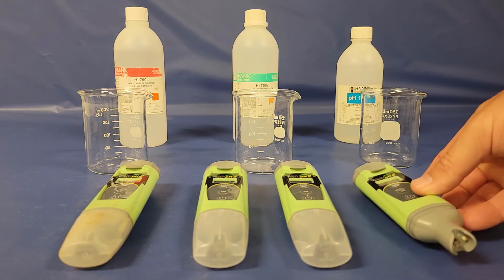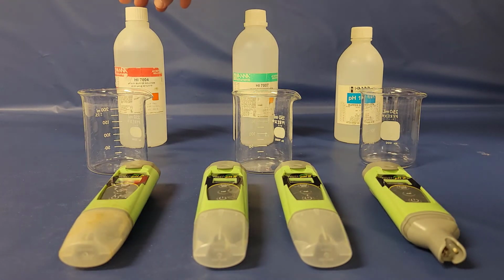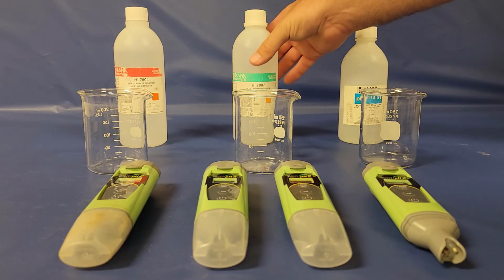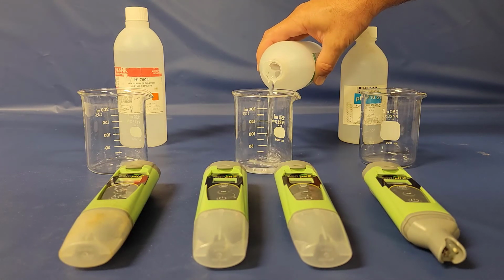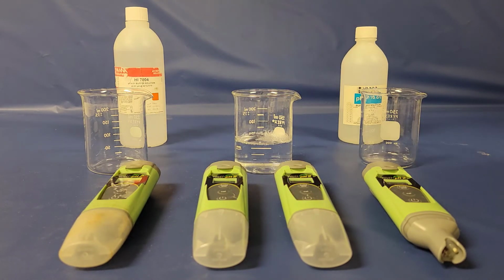So the first thing we need to do is start with some known solutions. You can see in the background here, this red one has a pH of 4. This green is a pH of 7, and this blue one here is a pH of 10. And the one you're supposed to start with is the pH of 7. So I'm just going to go ahead and pour a little bit of this. The amount that you're supposed to have is about 1 inch of solution in the container here. So we're going to fill this up to about 1 inch, right around there.